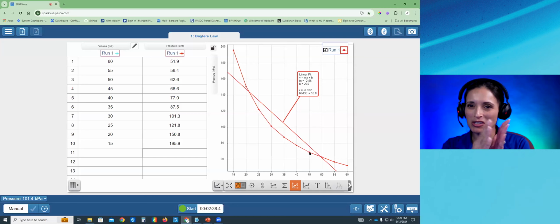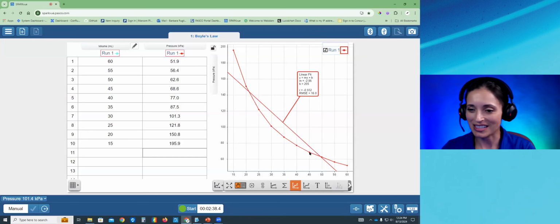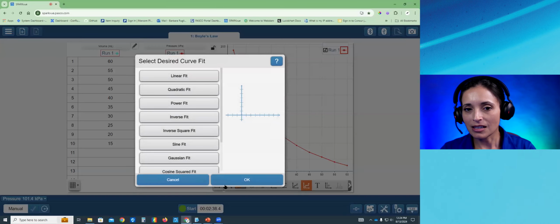The data is not really bunched close to that predicted line. So even though my R value, well, it's not super close to negative 1, that 0.9 looks like it's okay, but you can do better than that. And we could tell visually it's not really a good fit. So we go to the next options, the curve fit.